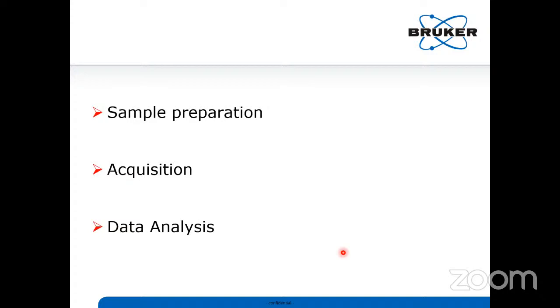Okay, good. You acquired nice data, around 1 GB, 2 GB of data. If you are not presenting your data, not confirming your data, not concluding your data properly, then there is no use of your raw data. You should have proper MS tools to confirm your protein sequence and your data. For this, you should know exactly what are called processing methods, data processing methods. You should know what processing methods to use for PMF level, peptide mass fingerprinting. If it is a peptide level, what parameters and threshold you have to give, what peaks you have to select, and at what range of signal to noise ratio you have to keep.